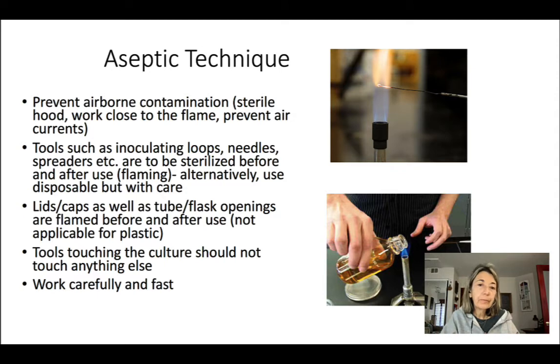Anything that can be flamed, and this is usually metal loops and needles, and even spreaders, which are glass, they can be flamed briefly, should be flamed. And the way you do it is you pass it through the flame and then you wait until it cools down.